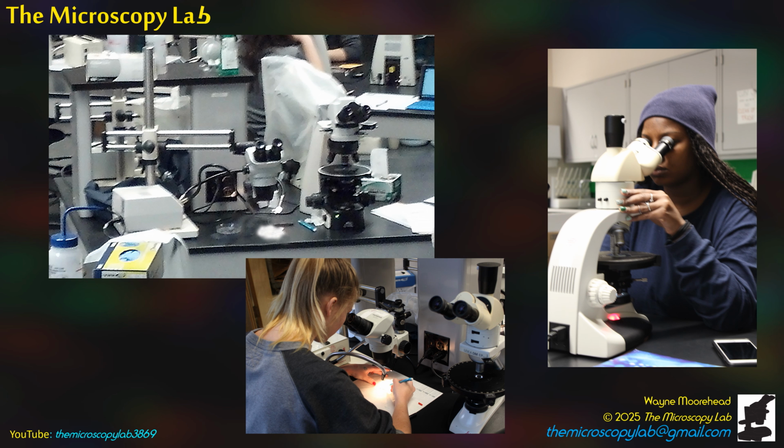But after just several weeks, the students were able to use the microscopes to separate mixtures and identify each component in a mixture by its optical properties.